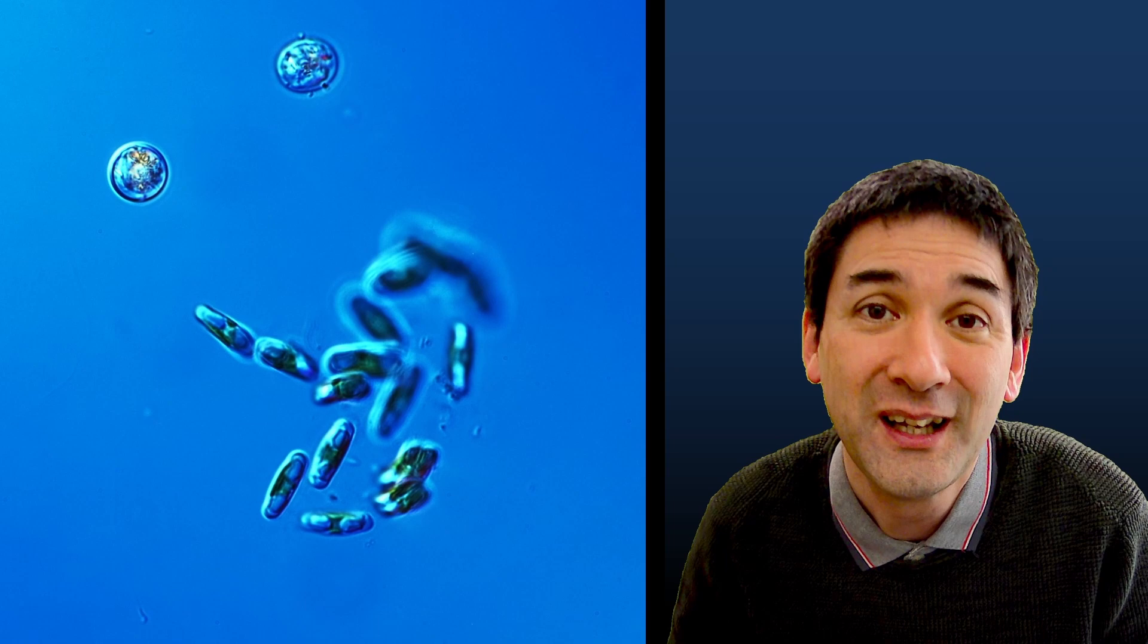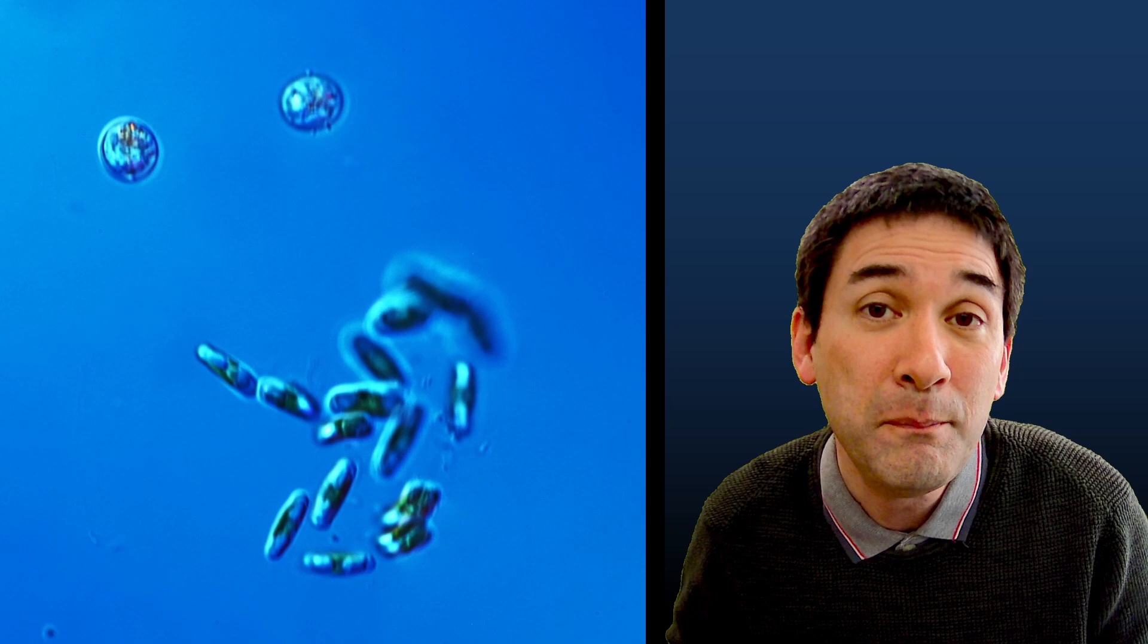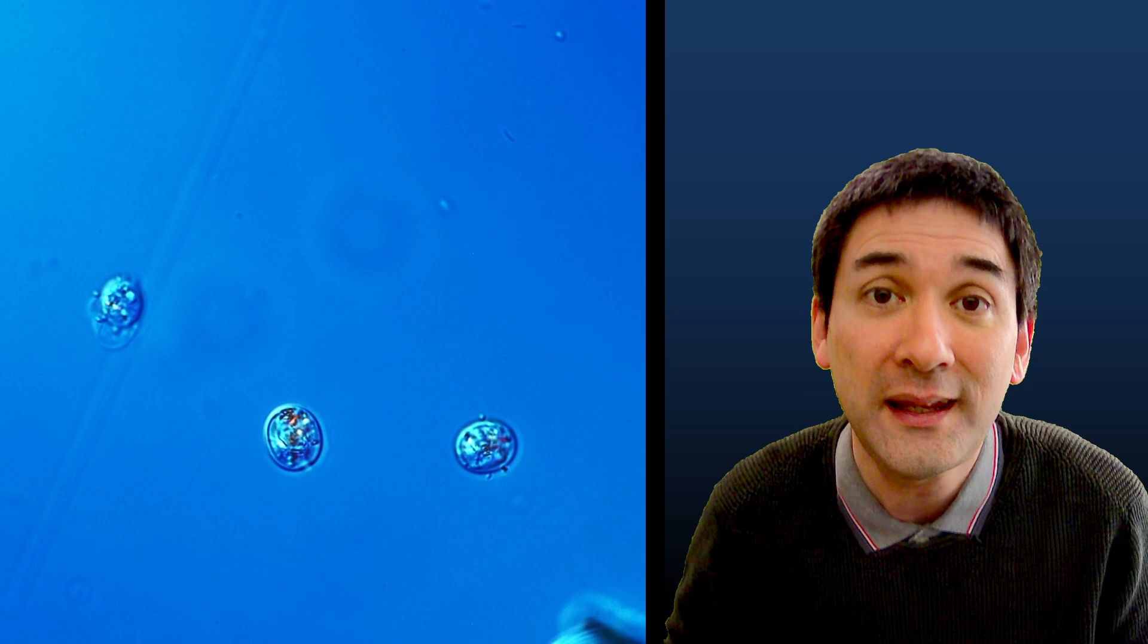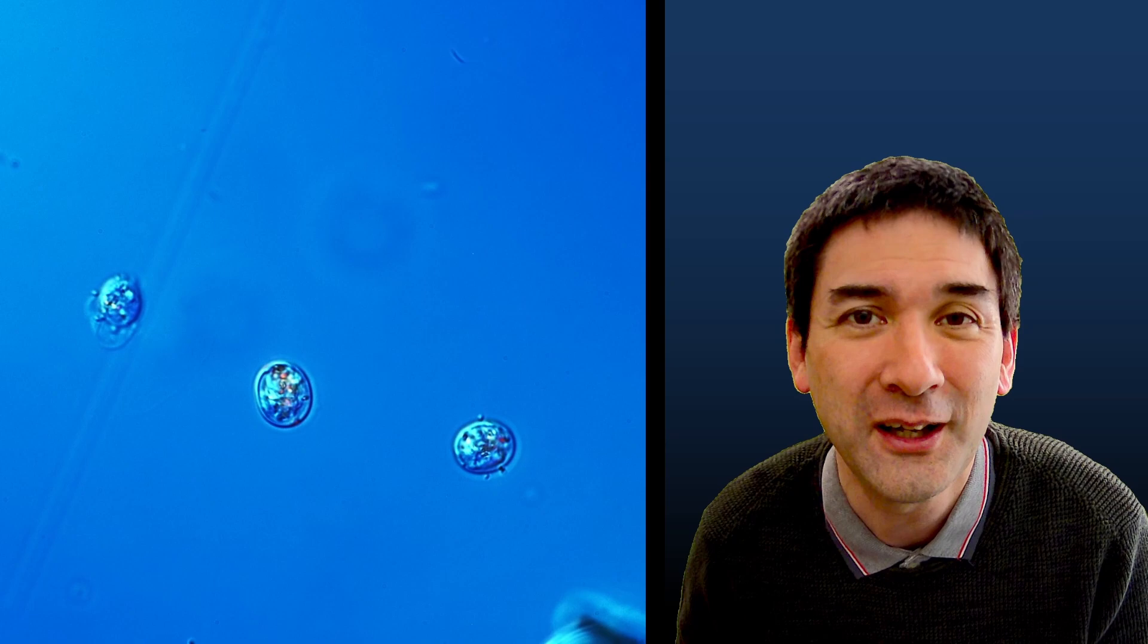Now, I have to tell you, I don't know what those round structures are. Maybe these could be the shells of some amoeba, some amoeba tests. They're called a test is a shell of an amoeba, but I'm not quite sure. And I have to do a little bit more observation to find out what it actually is.